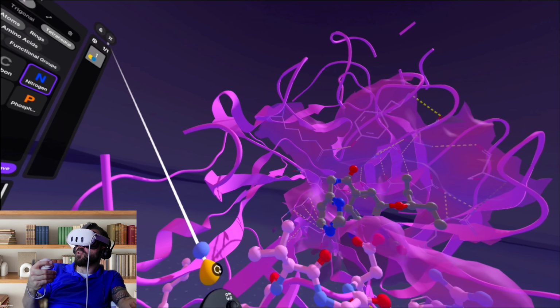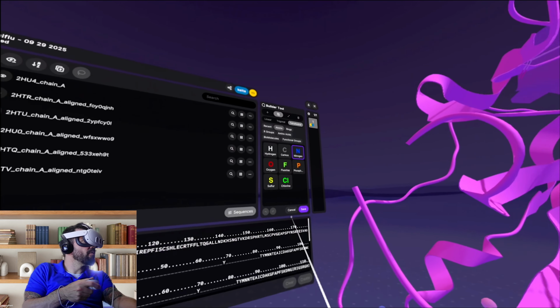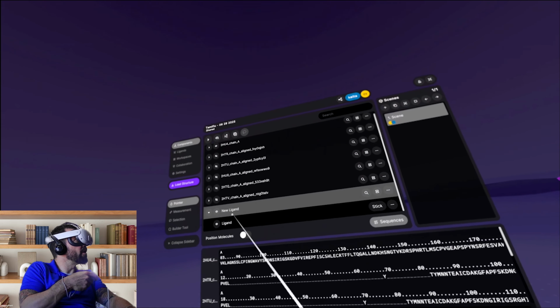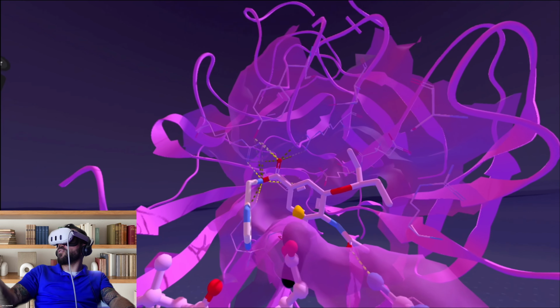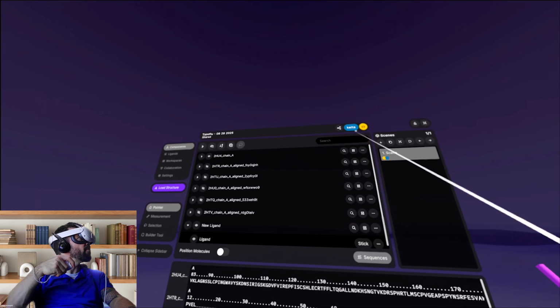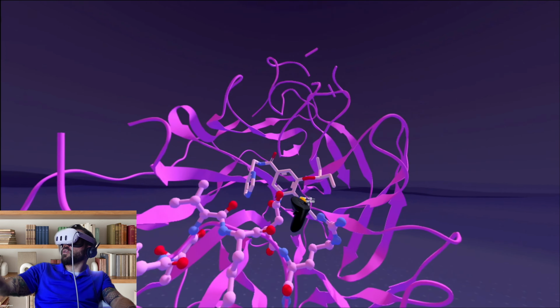We're just going to pop a little pyridine ring on. So we'll save that. We'll go to add new ligand. We can now see here in our hierarchy that we have a new ligand. The color change is subtle, but both of those are there. You can tell because we have a nitrogen and oxygen overlapping. So we can hide that entire site.